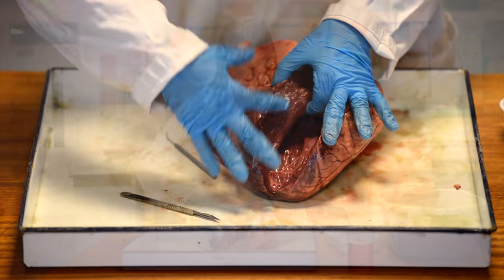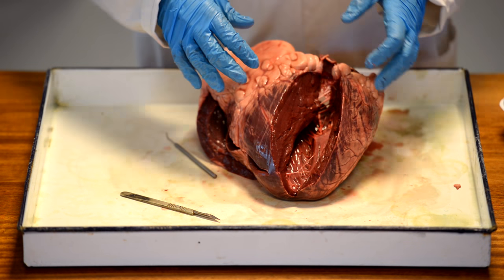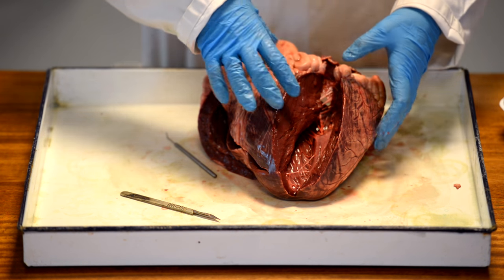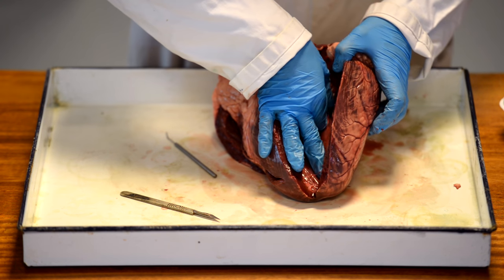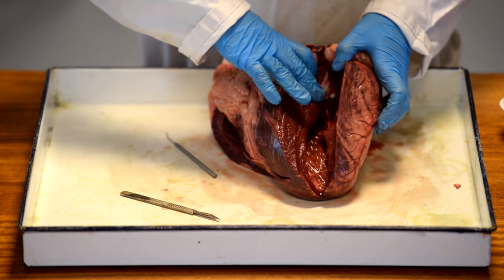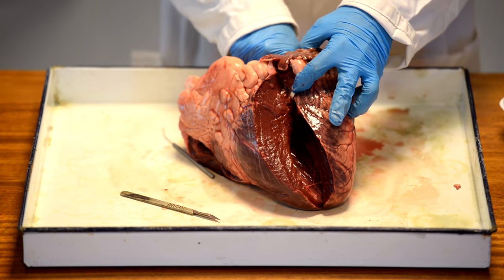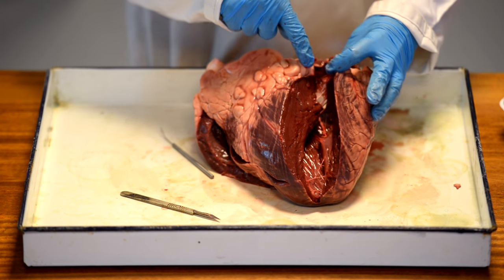Notice again the massive thickness of the muscle on this side, and also everything that was on the right hand side is multiplied on the left hand side. So the thickness of the muscle is so much greater, but also look at the strength of the fibers that prevent the backflow of blood, prevent the valve turning in the wrong way around.